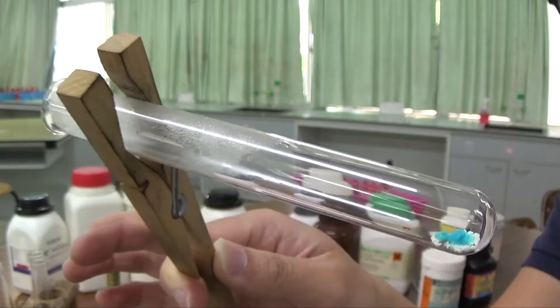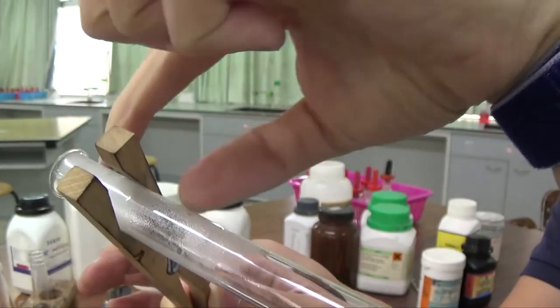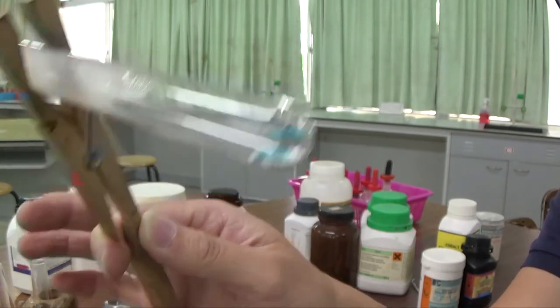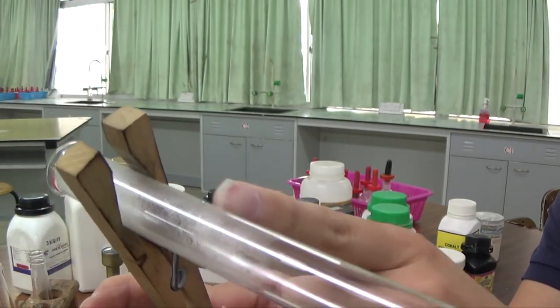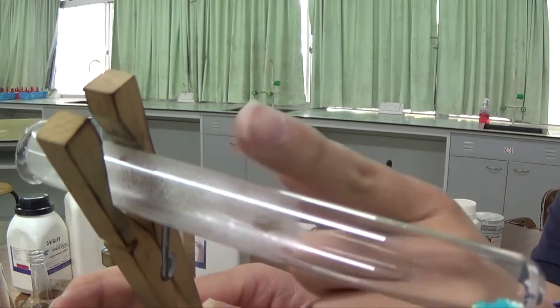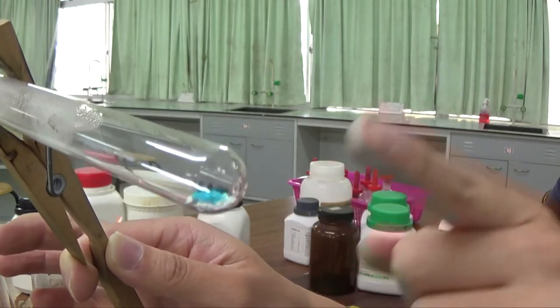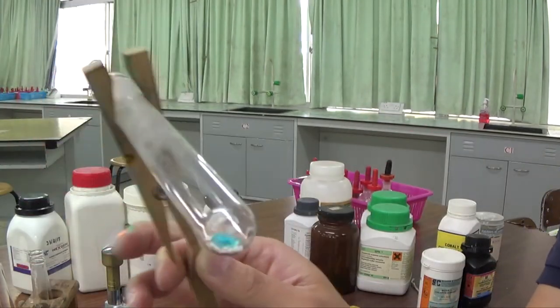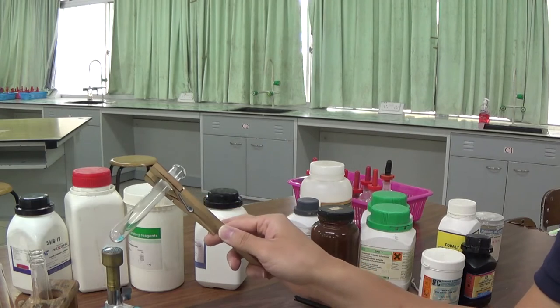Because your water vapor was inside, your steam was inside, it condenses on the upper part of the tube because the compound has water of crystallization. This is what you see. You see a colorless liquid form on the upper part of the tube. This is also what you see. The blue solid has turned white. I will heat it more strongly to get rid of all the water of crystallization, and hopefully it should make more sense in a little bit.